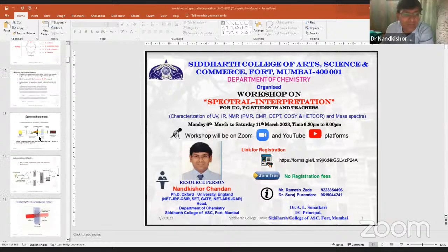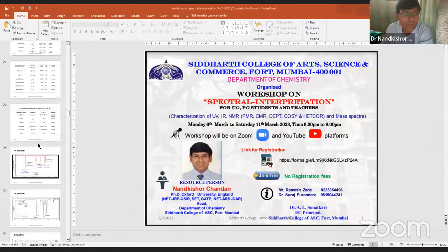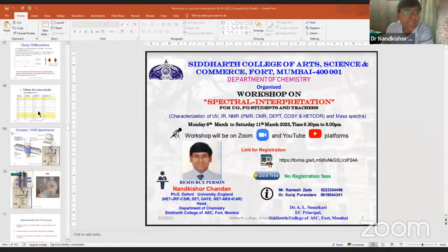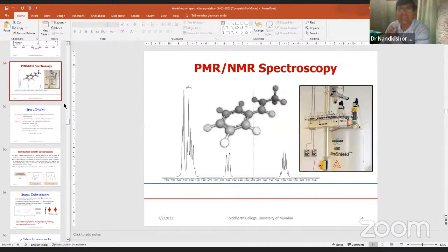So there is another very important spectroscopic technique that we call NMR spectroscopy. It is also called PMR and CMR, related to the nuclei of proton and carbon. In this talk, we are going to discuss PMR and CMR, that is proton magnetic resonance and carbon magnetic resonance.